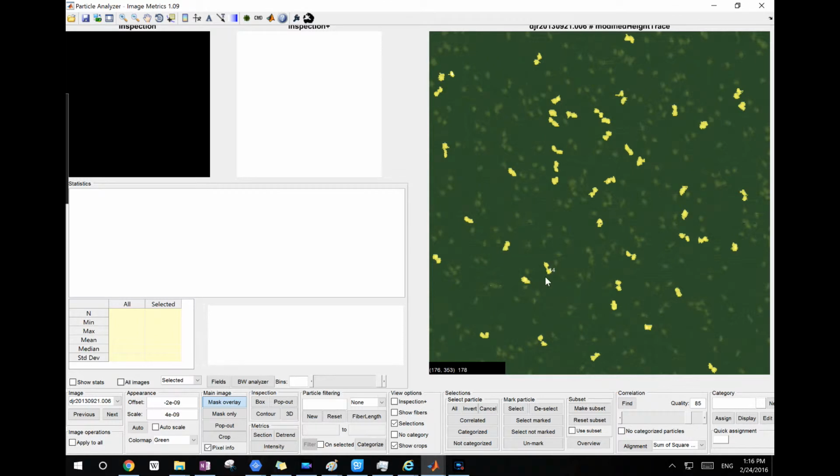To find the targets that match up with these particles, you can actually select multiple particles as templates. You don't have to select just this one. For example, if you want to match two particles at the same time, then you can select two of them. What the program does is it will find particles that match up with this one and particles that match up with that one, and make a union of those selections. So it's not an intersection of these matches, but a union of the results. For simplicity, I'll just select one particle for now.